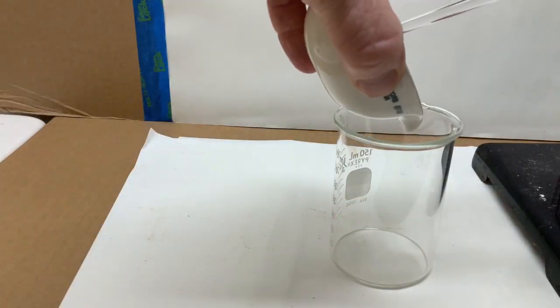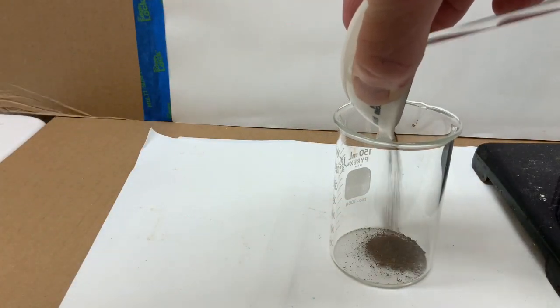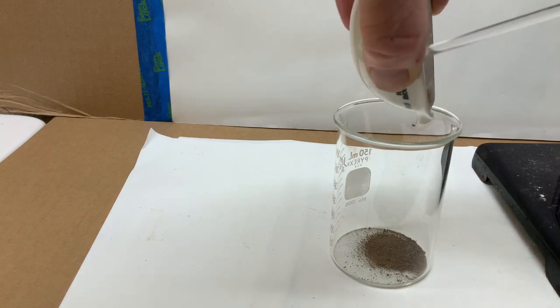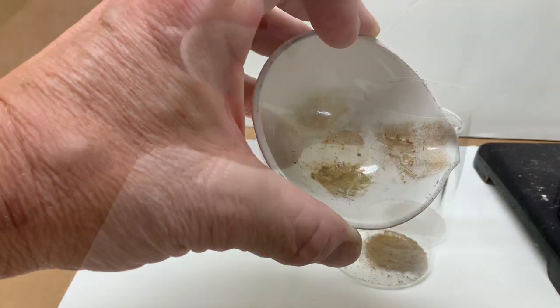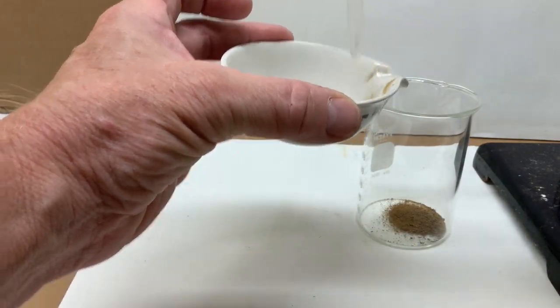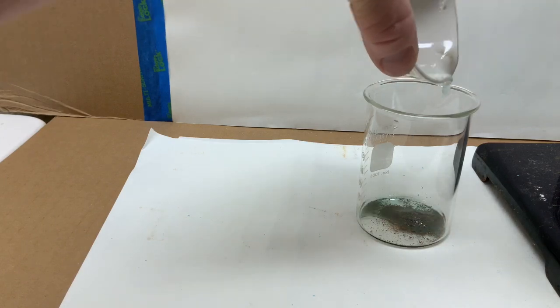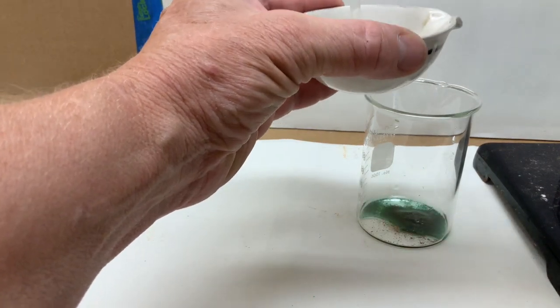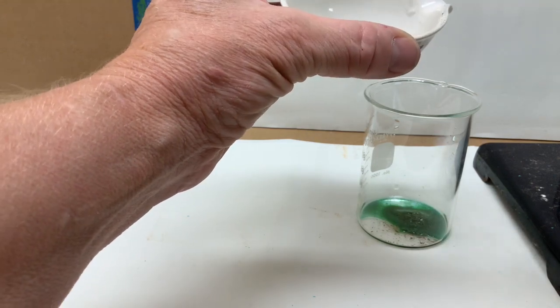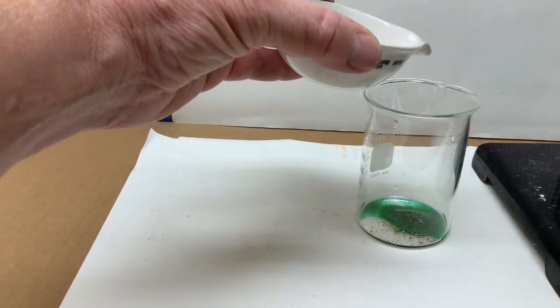Next, the anhydrate will be placed into the beaker and rehydrated by adding water. Watch carefully for the color changes during the dissolving process. Water will be used to clean the dish to be sure that all of the chemical makes it into the beaker. You can already see a color change happening. Refer to your lab sheet and be sure and make some observations.